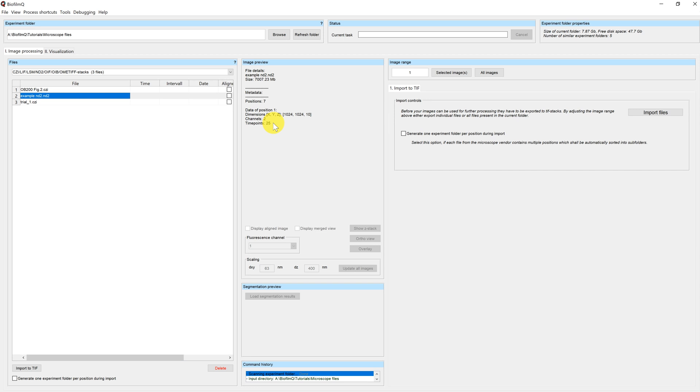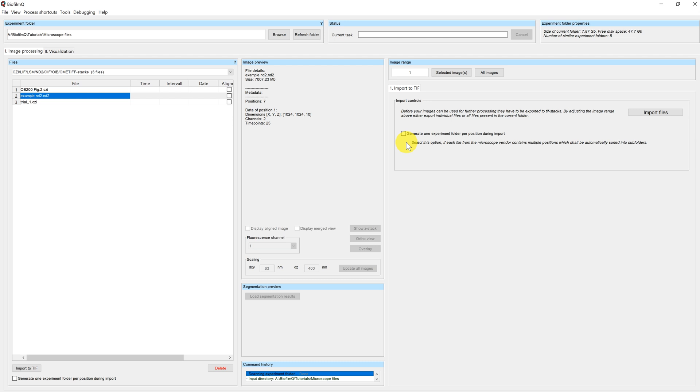Now, if you want to convert this data, you have to go over to this dialog here, where we have the button import files, as well as the option to generate one experiment folder per position during the import. And this means that, for example, in this case, when I have seven positions, there will be seven separate folders generated, and the images are sorted into those folders. So I will click this here in order to generate separate folders.